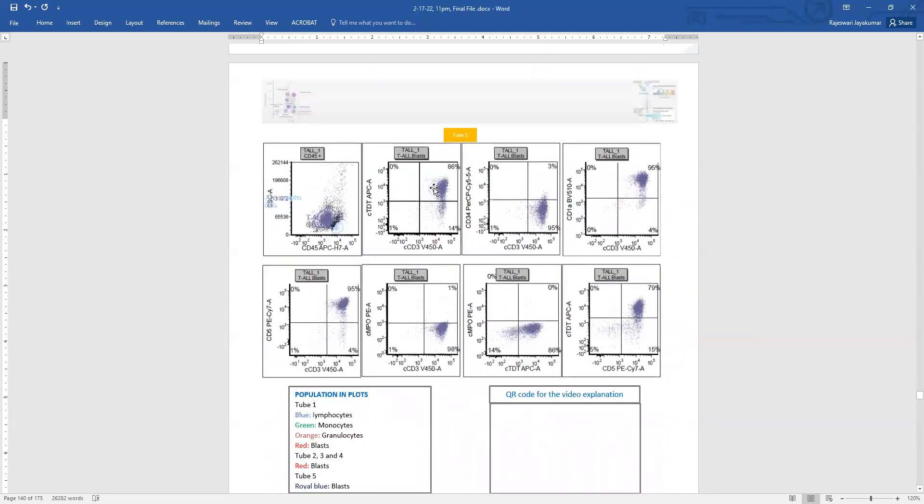So here is TDT. So in this cytoplasmic tube, we have cytoplasmic CD3, and all the cells are positive for TDT, brightly positive for TDT. So now we have established that these are all blasts. So this is a T lymphoblastic leukemia lymphoma presenting as a lymphoma.